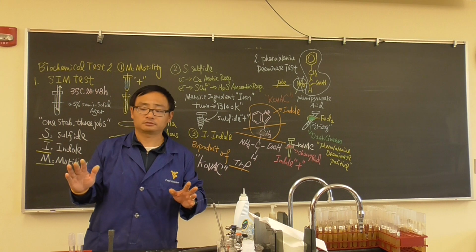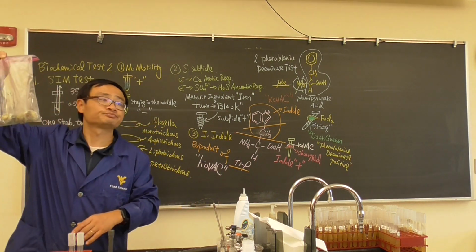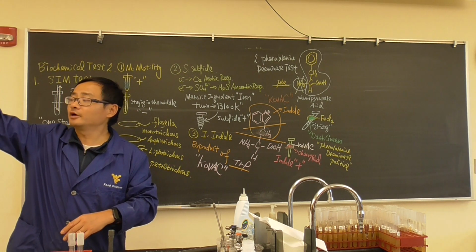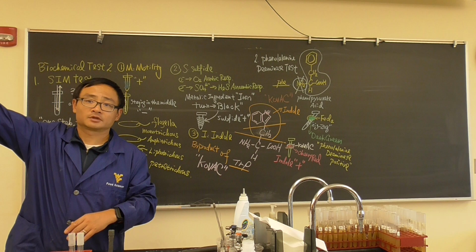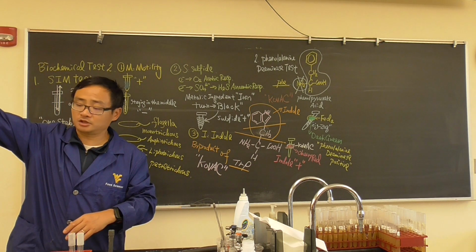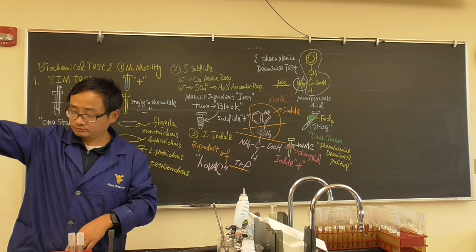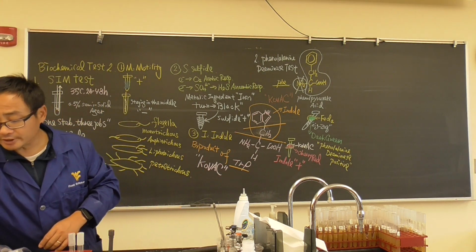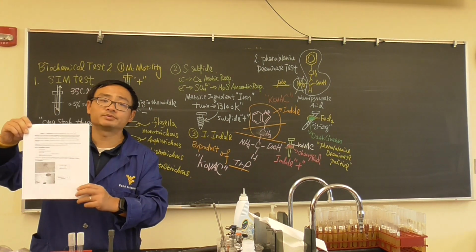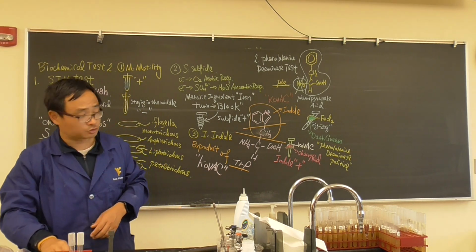Okay, not done yet. We have big stuff we haven't talked about yet. A very moldy Asian meatball. It has been in the back of my car for around two months already. So they're very moldy. What are we gonna do? Based on this fact sheet, we'll do an observation of what type of molds they are. We haven't talked about molds too much.